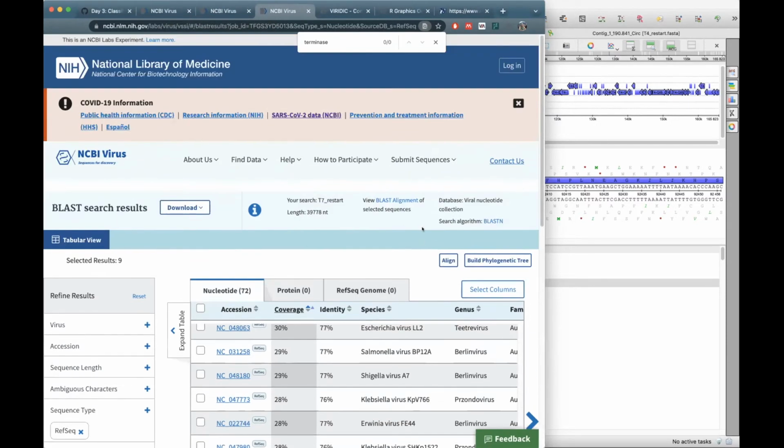So, could you please highlight again the difference between the phylogenetic tree that can be produced by the virus and what we are going to do later, or what Andrea explained? Is there any difference between the phylogenetic tree that we can produce with the NCBI tool? Yeah. So here the tree is based on your BLAST results. BLAST results are pairwise with your search query.